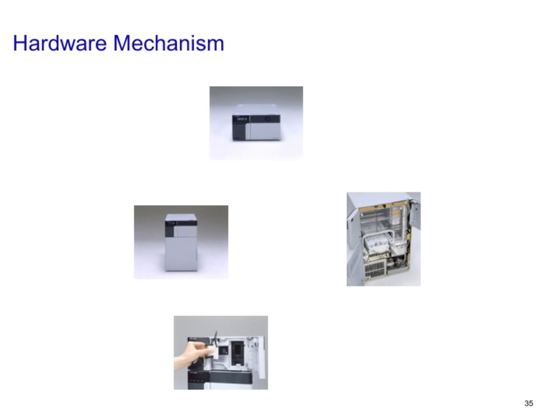Moving on, let's consider the cell structures used in typical detectors. The hardware mechanism involves the physical design of the detection cell, which is fundamental to achieving accurate measurements. The cell must be precisely engineered to optimize factors like optical path length, flow dynamics, and minimizing noise.